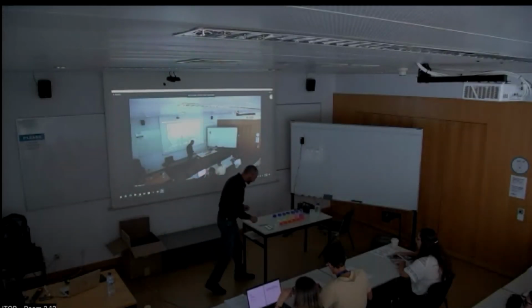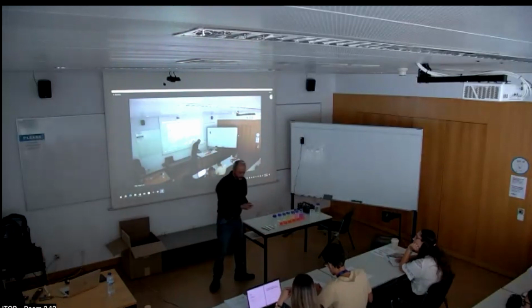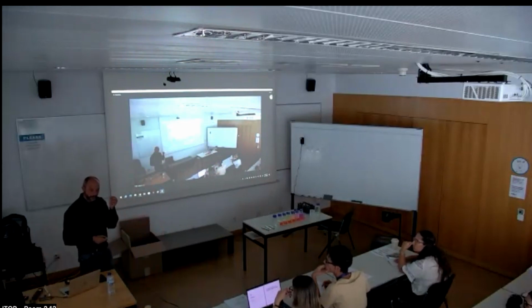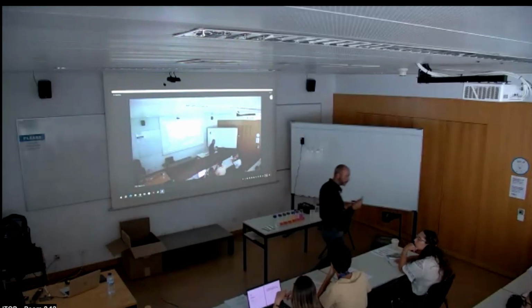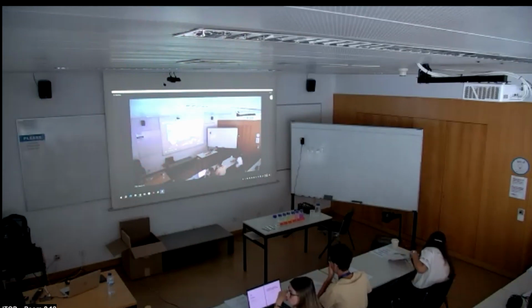So I have a laser here, and this is a 635 nanometer laser, so it's red. And I have a wire here. It's a very thin wire, very thin. I will shine this light on the wire. Before I do it, I would like you to tell me what you expect as a result. I will go later, so you will see the result a little bit enlarged. And I'm really sorry because those of us in the back might not see very much, but I will do it from here.